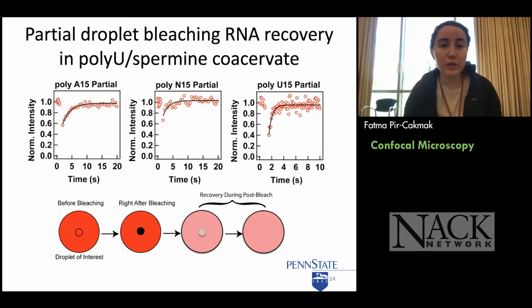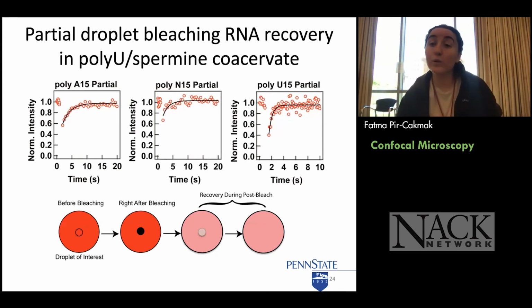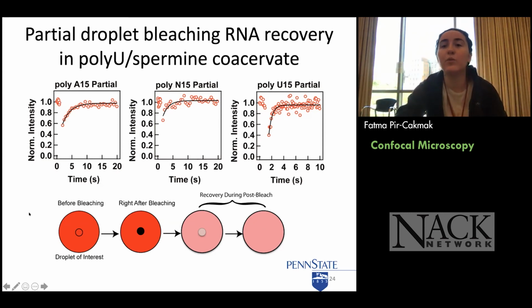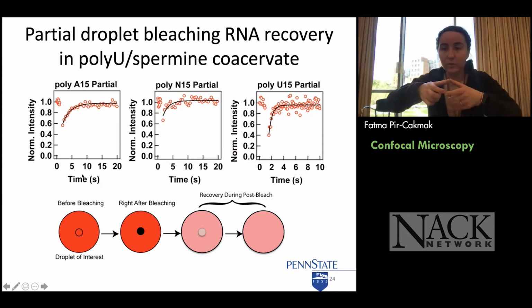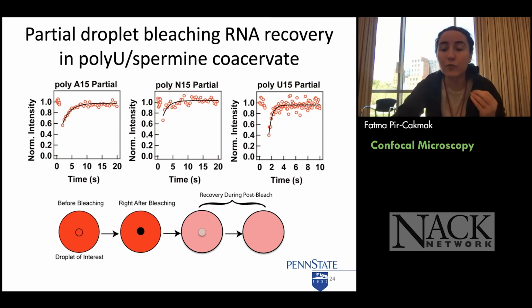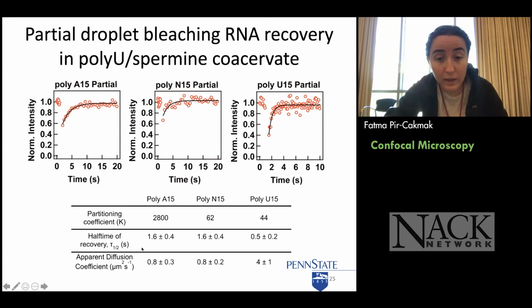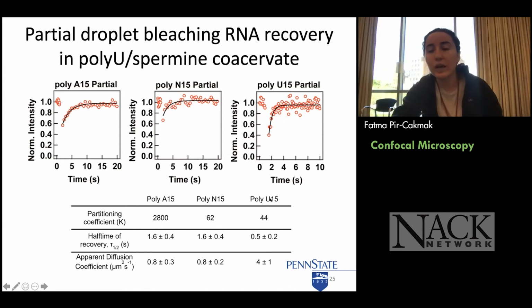When I look at these samples, what I observe for the three different types of biomolecules I have looked at is that the partial droplet recovery is quite fast. It doesn't really matter what type you have. Within the droplet, it diffuses so fast and recovers quite fast. And if you look at the diffusion coefficient, it's very similar.